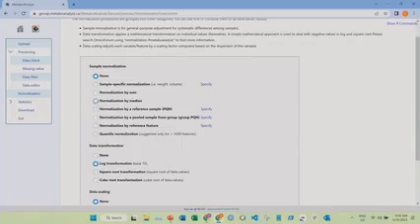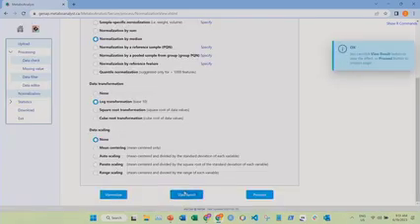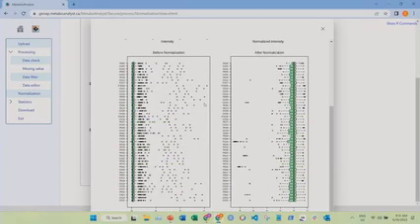So again, the most common ones are normalization by sum or normalization by median. I usually use this. You can do it specifically by some feature in your data, like a reference feature or a reference sample, but that's going to be really individual and depend on your specific data set. So if I did this, it looks like this. Again, the sample level. You can see now we normalized by median. This black line in each box plot is the median. And so you can see now they're exactly the same. We've basically just forced them all to be exactly the same.